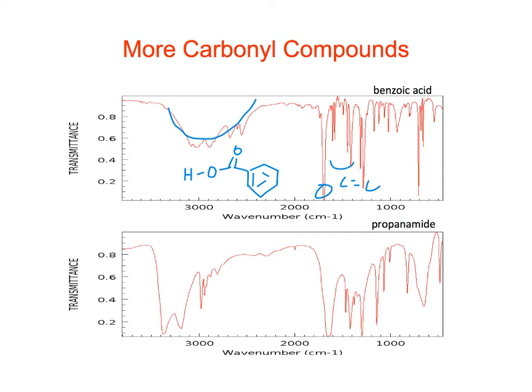I guess these show up very strong, and I don't know why they're so broad, really, but what they talk about is that they tend to form dimers, like this, between the 2 carbonyls, right? They dimerize, and so they form some very strong hydrogen bonds.